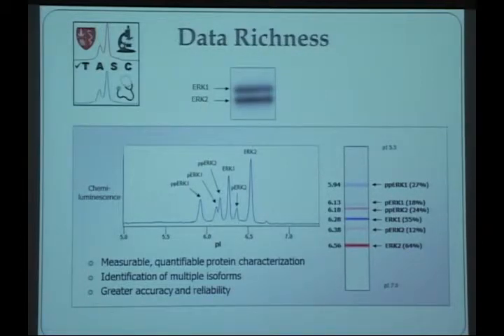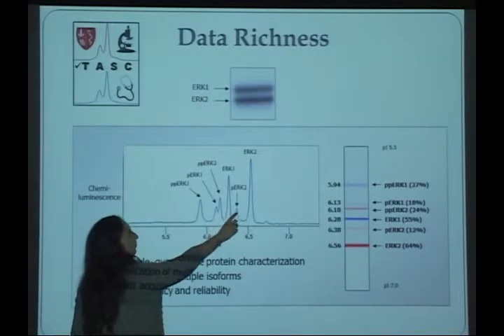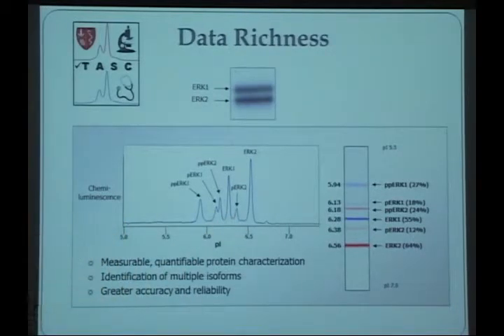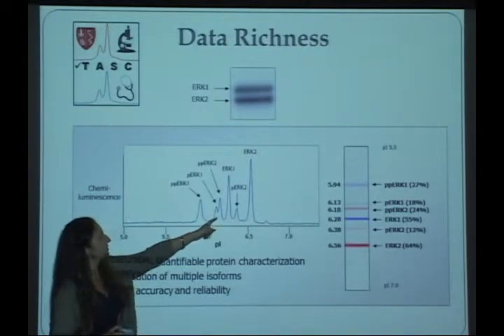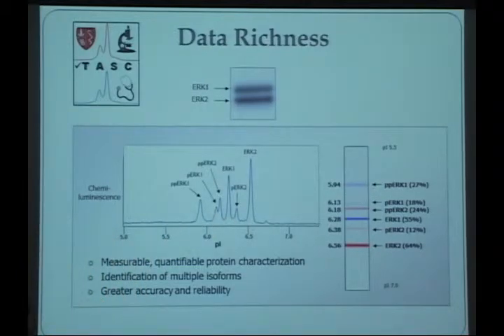However, if you do a NanoPro assay, not only do you get the expression of those 2 main peaks, ERK1 and ERK2, but you get everything else in between. Any phosphorylation that happens due to whatever treatment of cells you have done, or a therapeutic that a patient got and you're analyzing those cells, you'll be able to detect those phosphorylated isoforms, as you can see in those peaks, and you'll get very reproducible and quantitative data.